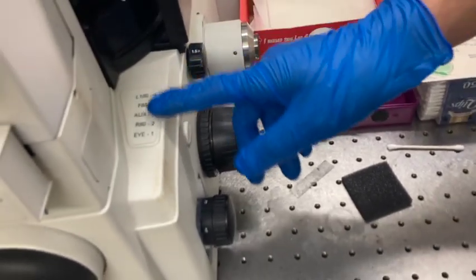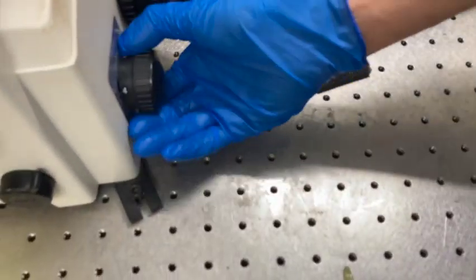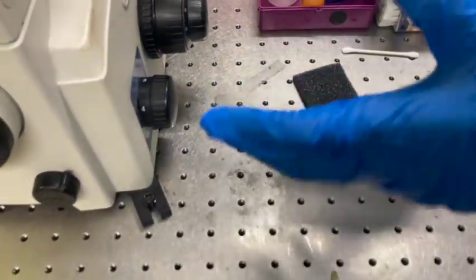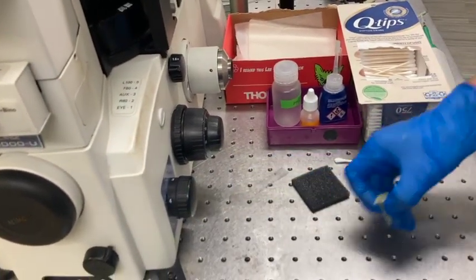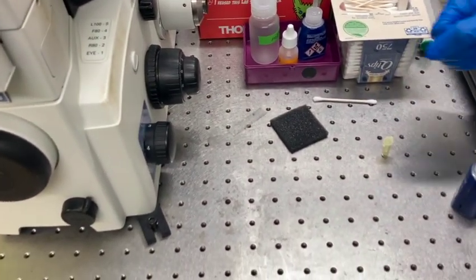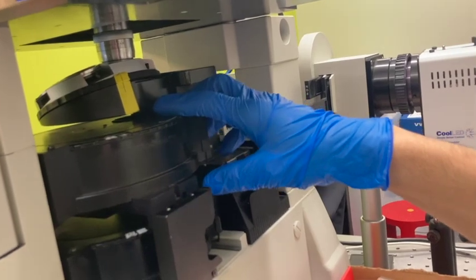Based on this table, 5 is the left pole, but maybe shift it a little bit. Just remember 4 is the default and don't touch it. Hey, you are about right on time. We're talking about the most important thing here. So there is a special mark here.